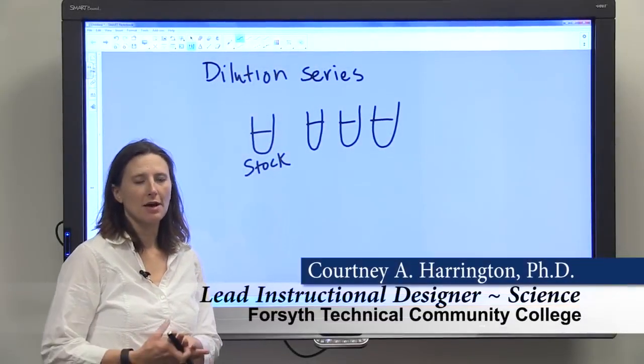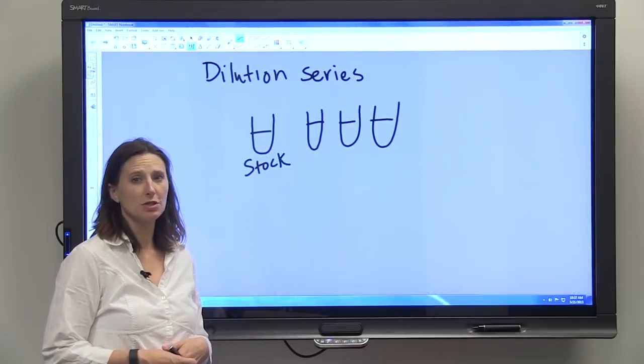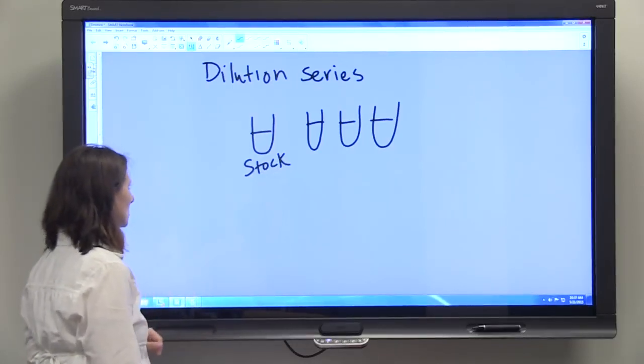Okay, we're going to talk about two other types of dilutions besides simple dilutions: a dilution series and serial dilutions. So first let's talk about a dilution series.